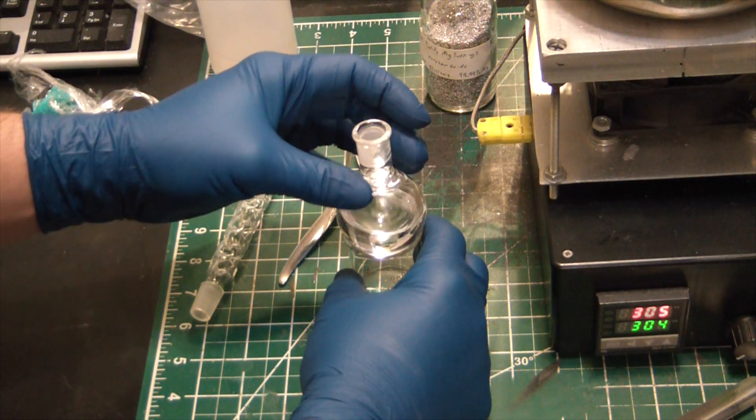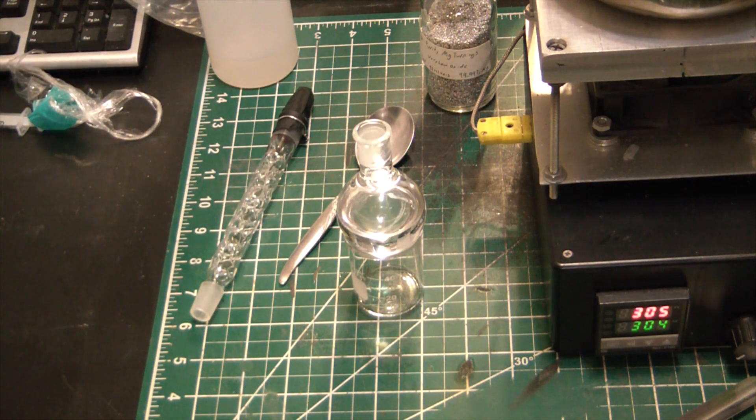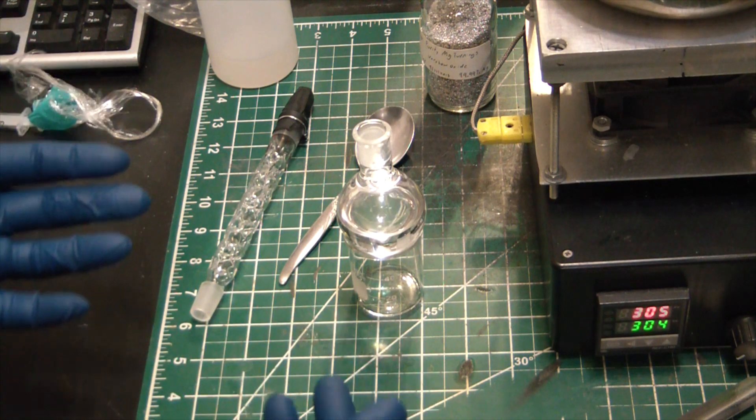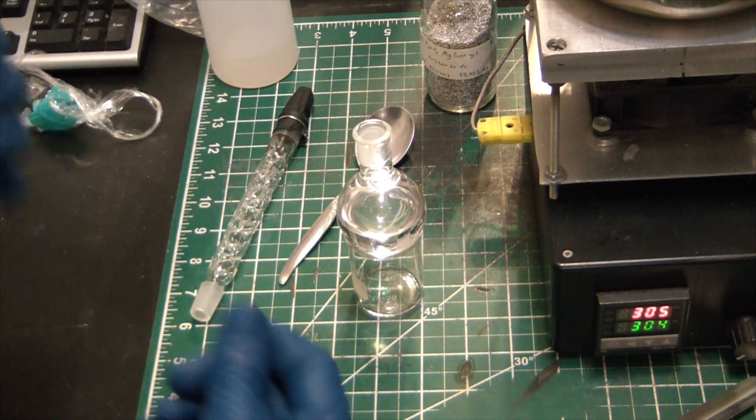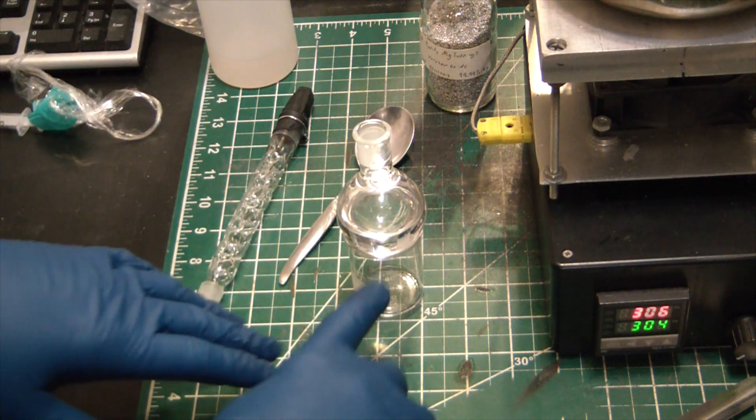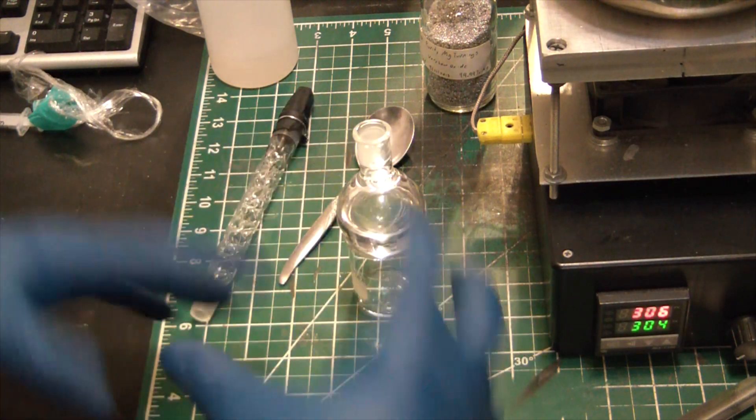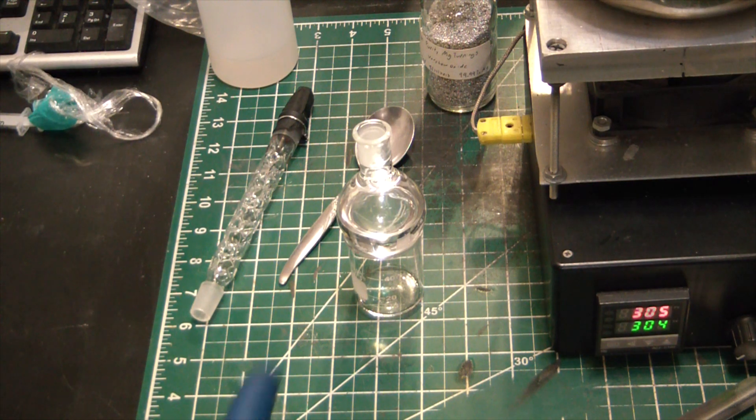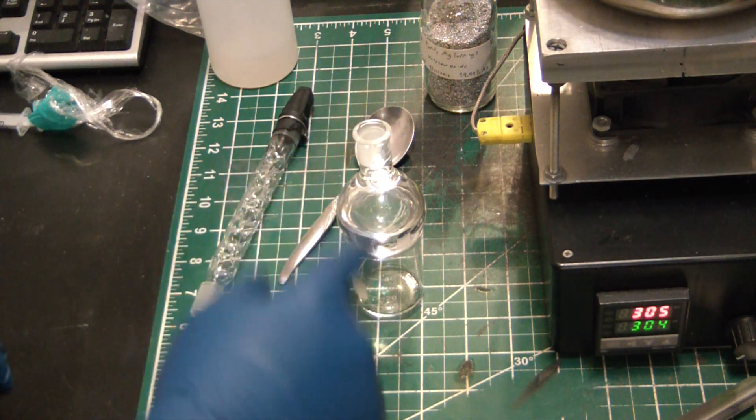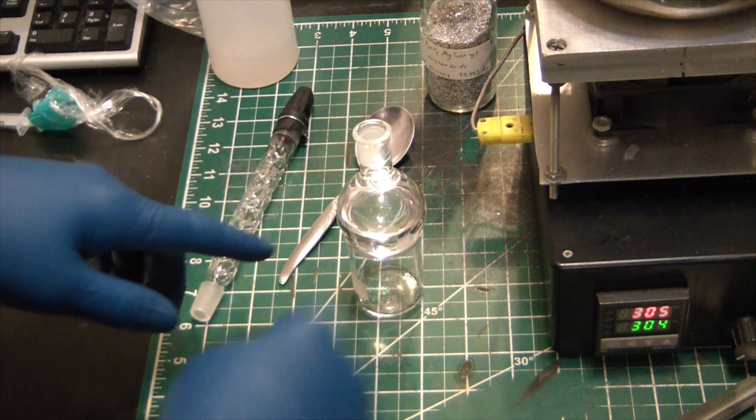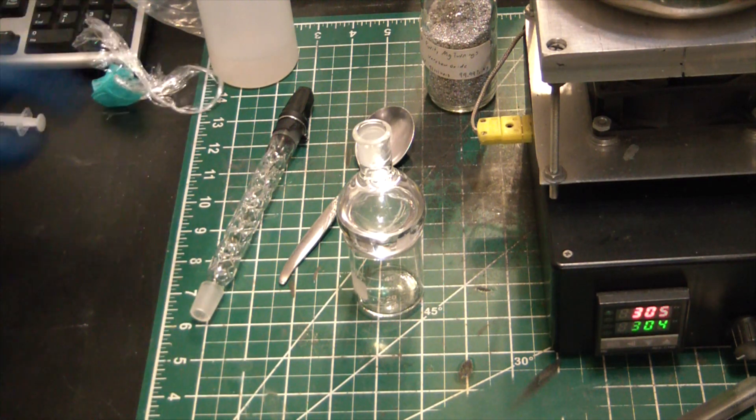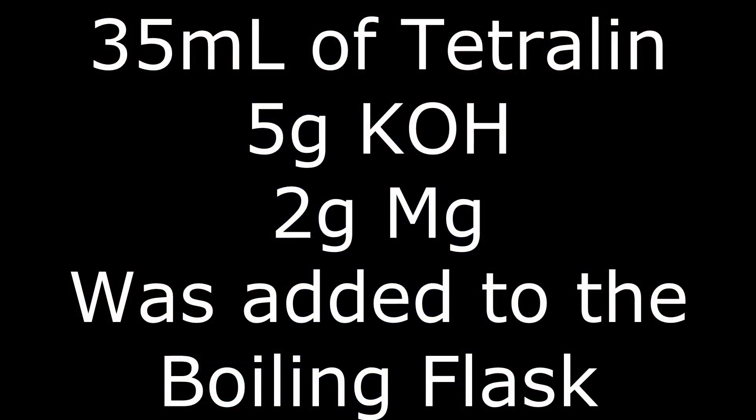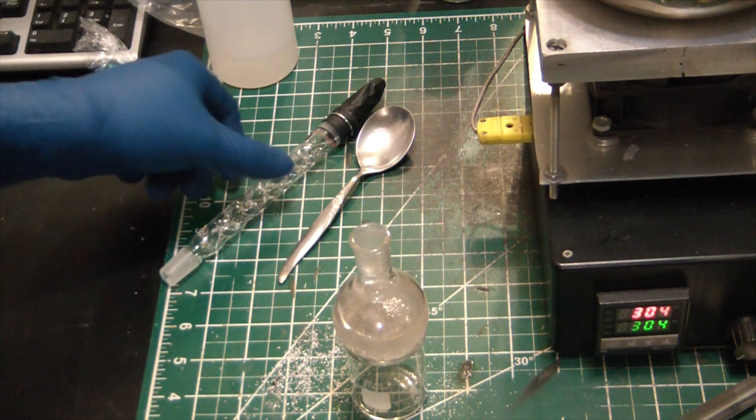See I didn't screw around sealing this sucker up. Now the reason we're using tetraline here is because it's a very dense solvent. It is more dense than the elemental potassium. So when the elemental potassium forms, the balls of it are going to float up to the top and coalesce into larger and larger globules. The last time I made it I actually had a piece so big I couldn't get it through the neck of the flask and I had to cut it in there and pull it out in two pieces.